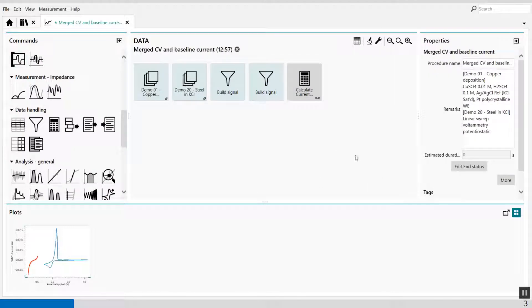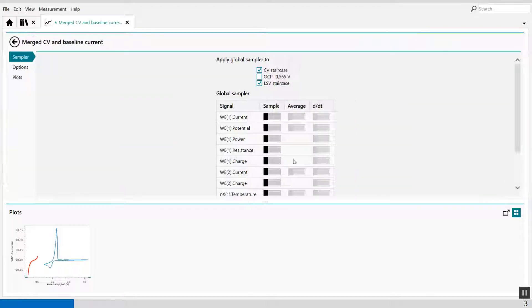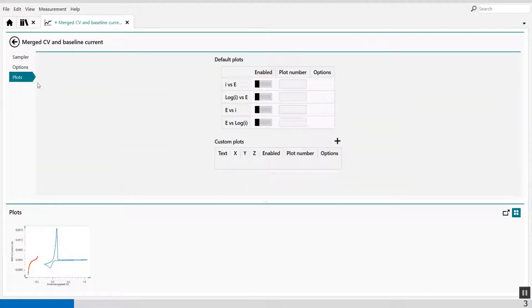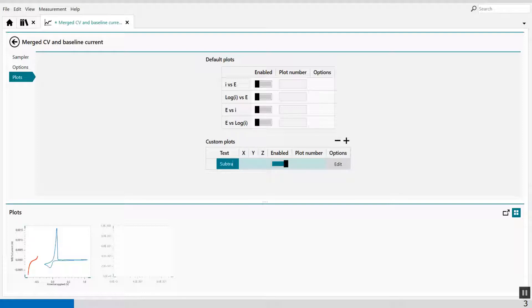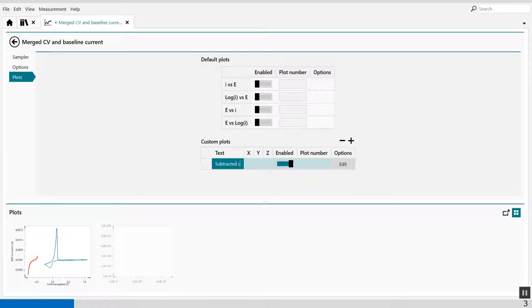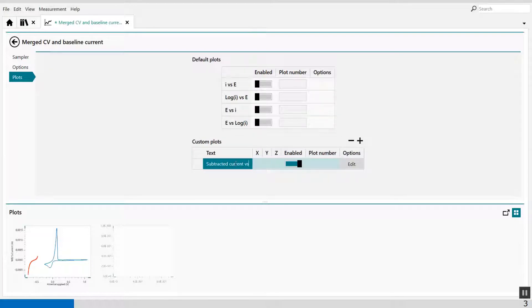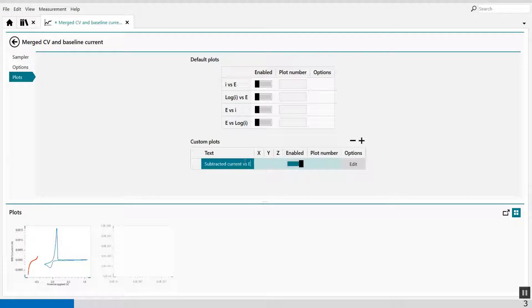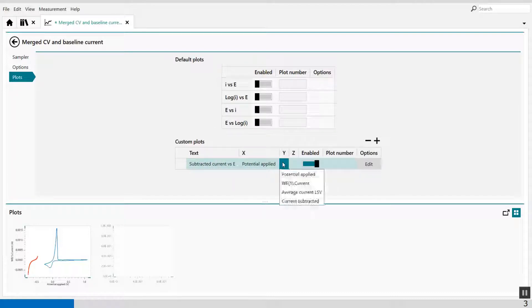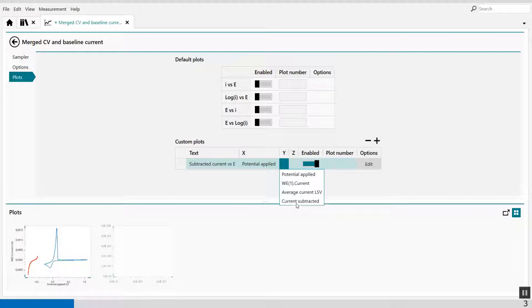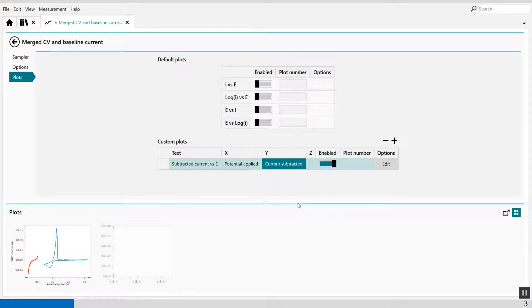With this information, I can go to more and create a plot. A special plot, which is the subtracted current versus the potential. So I can say subtracted current versus potential. On the x-axis, I say potential applied. And on the y-axis, I say current subtracted.